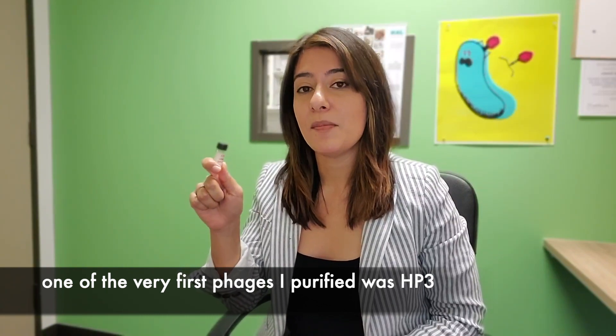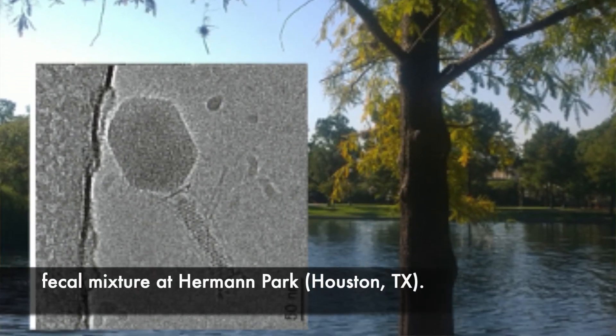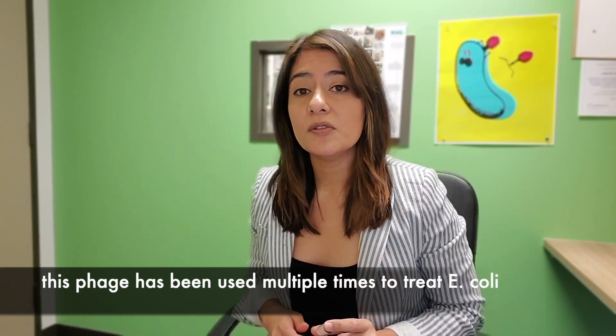One of the very first phages that I purified was HP3. This was a phage that was originally isolated from a goose-duck mixture at Herman Park. It's been used multiple times to treat different E. coli infections in patients.